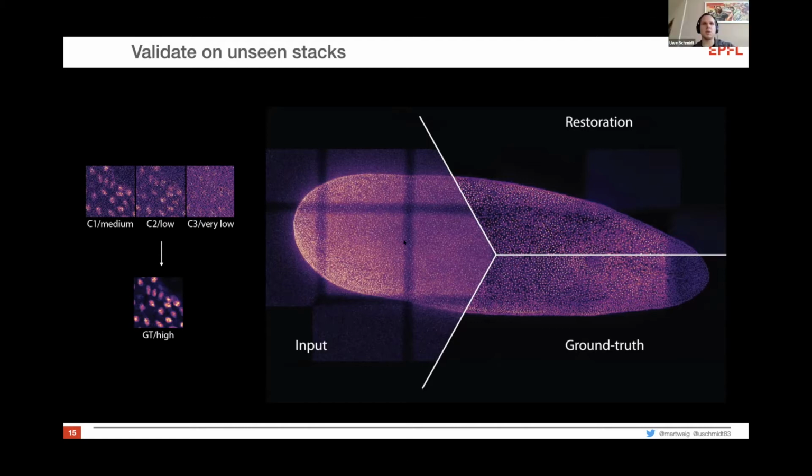Yeah, but you can also adjust for that. You make it easier for the network to learn. Sure. So if you have some flat fielding, just do it. Yeah. If you have a flat field anyhow, which you probably have, if you have a strong vignetting, then doing that before is of course always better, right?